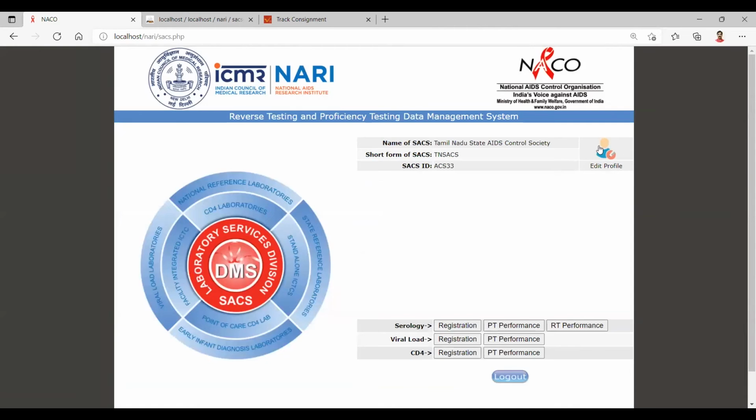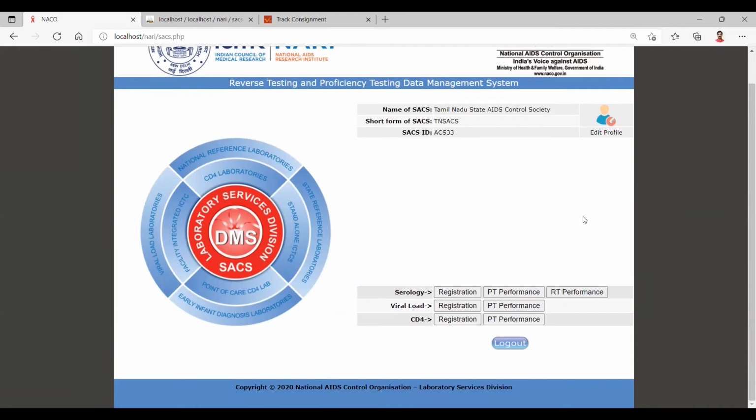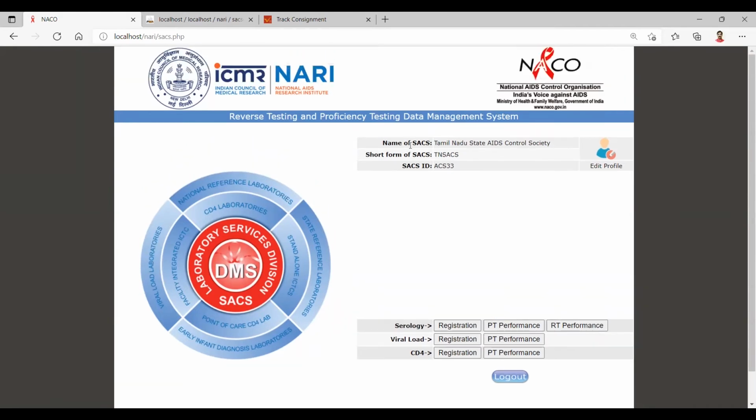And this edit profile you can use as and when required. Wherever changes happen, maybe somebody's telephone number changed or any new staff came, or something is more important, anytime you can go and update, but all the movements behind are being recorded in the server. So every modification is recorded, and the system can understand who did that and from where. So this is all self-explanatory for their own divisions and all departments' management.